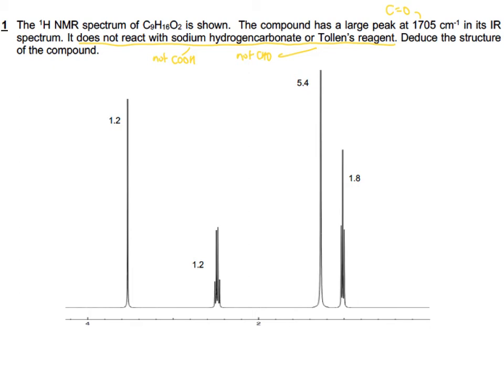So if I work from left to right, 0.6 into 1.2 is 2. The next one is 2 as well. 0.6 into 5.4 is 9. And then we've got 3. Before I move on, I would add all of those together.